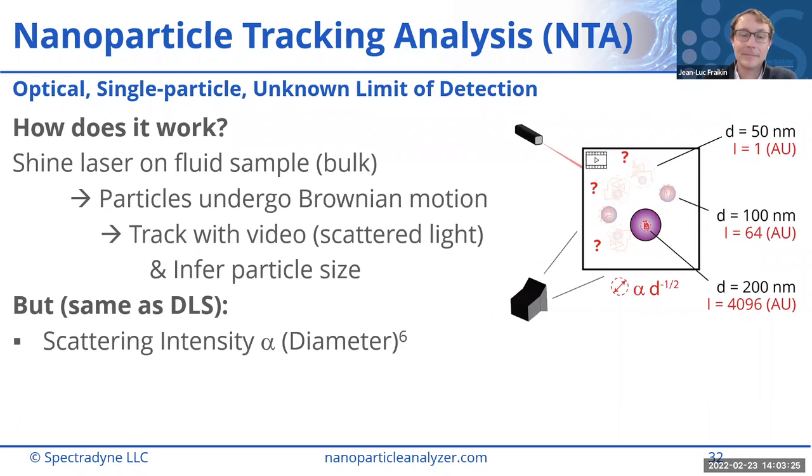We are assuming that a lot of our particles are more sheet-like or rod-like in nature. What are the limitations of measuring our particles on the Spectradyne? Would we have to do multiple cartridges?